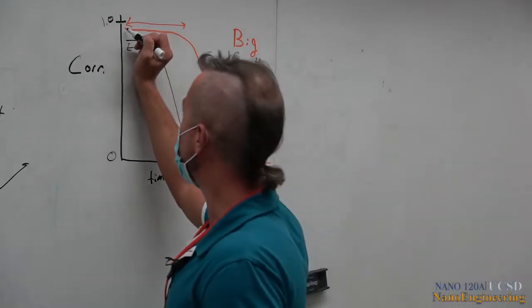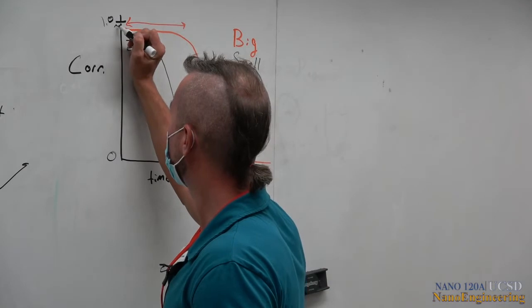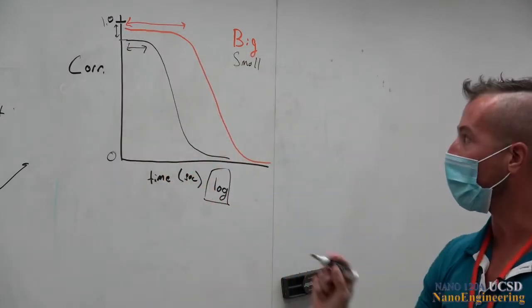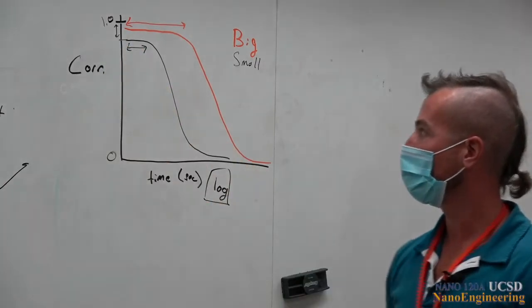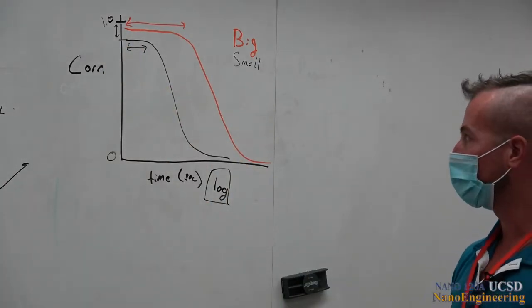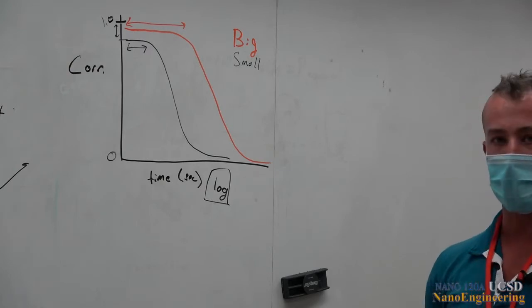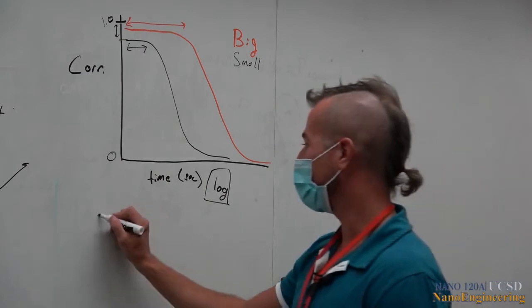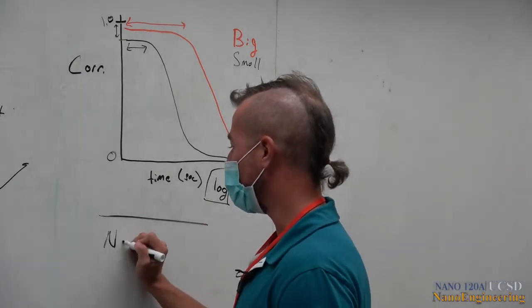What about this? See how this does not perfectly interact with 1? What's that a function of? Well, you know, it's primarily the impact of noise.